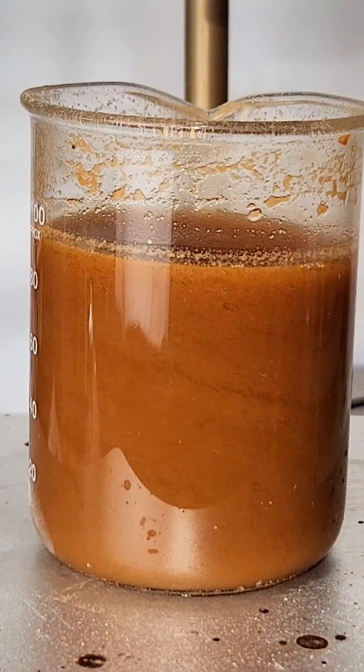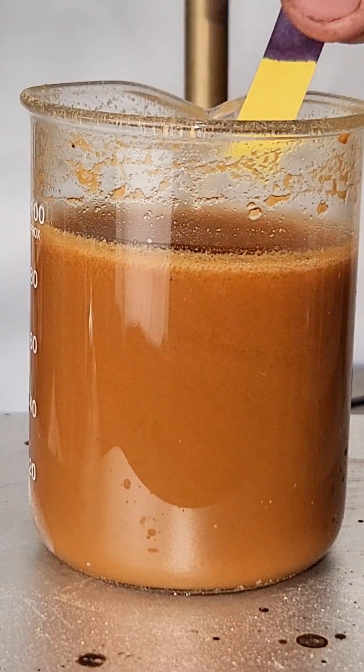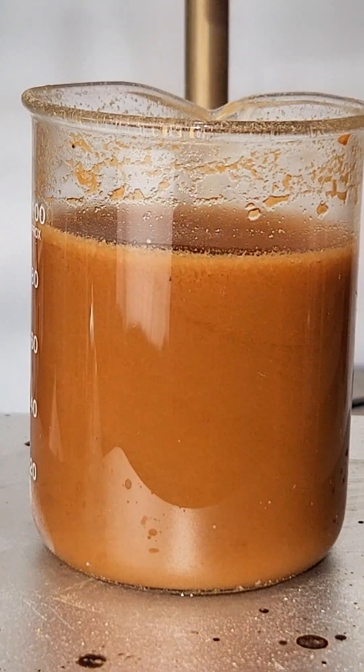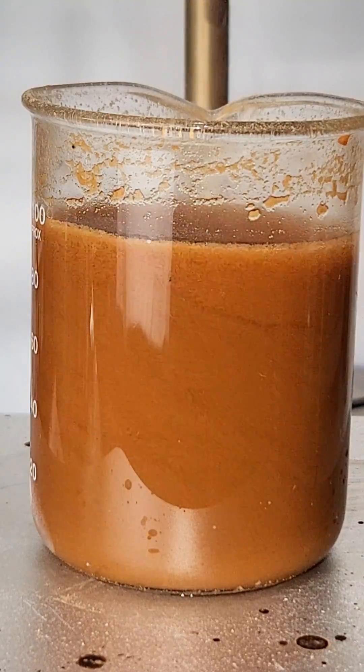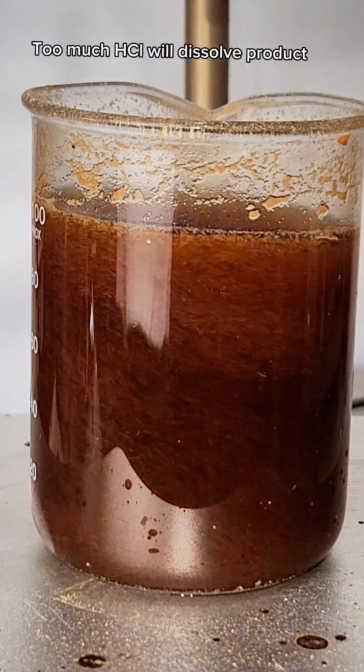Because of this the addition of too much hydrochloric acid can cause the product to redissolve which I accidentally did. Fixing this though is pretty easy and all you want to do is add some sodium hydroxide to balance your pH back up to 3.5.